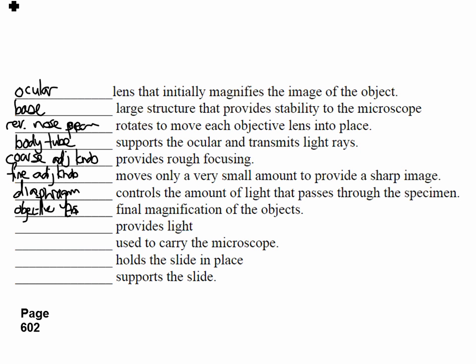Provides the light. I got this one. The light source. Used to carry the microscope. Yep. Marshall? Arm. It is English. It's just not good writing.